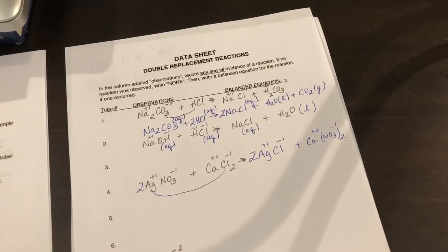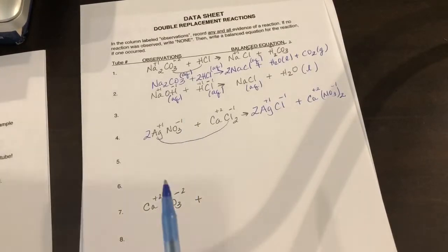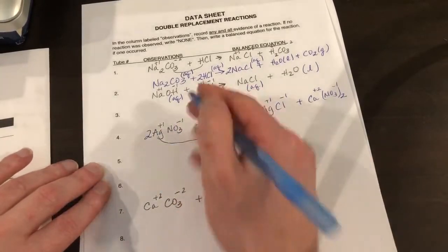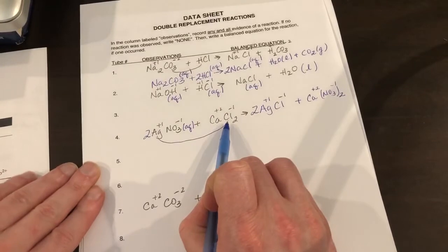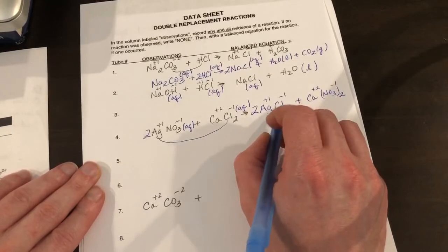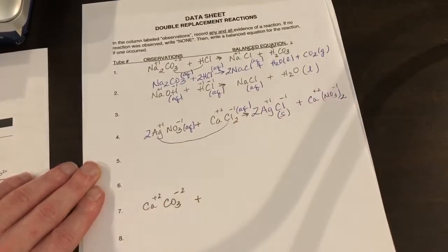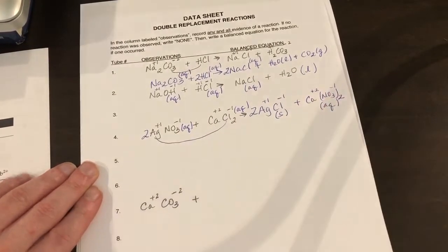I didn't do my states on this other one. Let's go ahead and do our states on this one. I keep forgetting to do that. Sorry, guys. Okay, all nitrates are soluble, so you write AQ. All chlorides are soluble except for silver, mercury, lead, so you write AQ. Ag is silver, so you write S. It's insoluble. And all nitrates are soluble, so you write AQ.